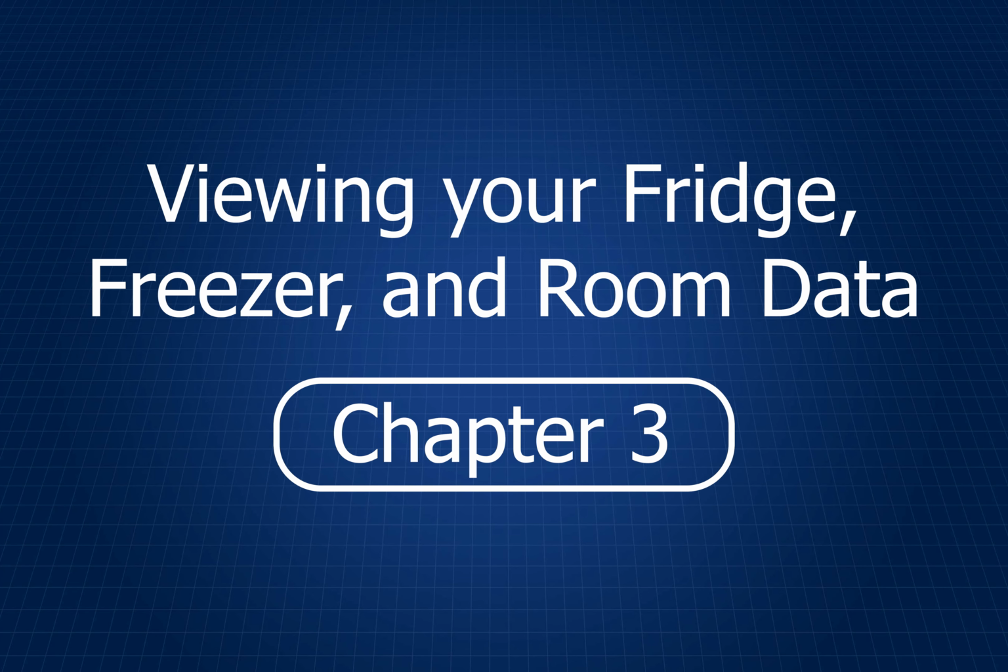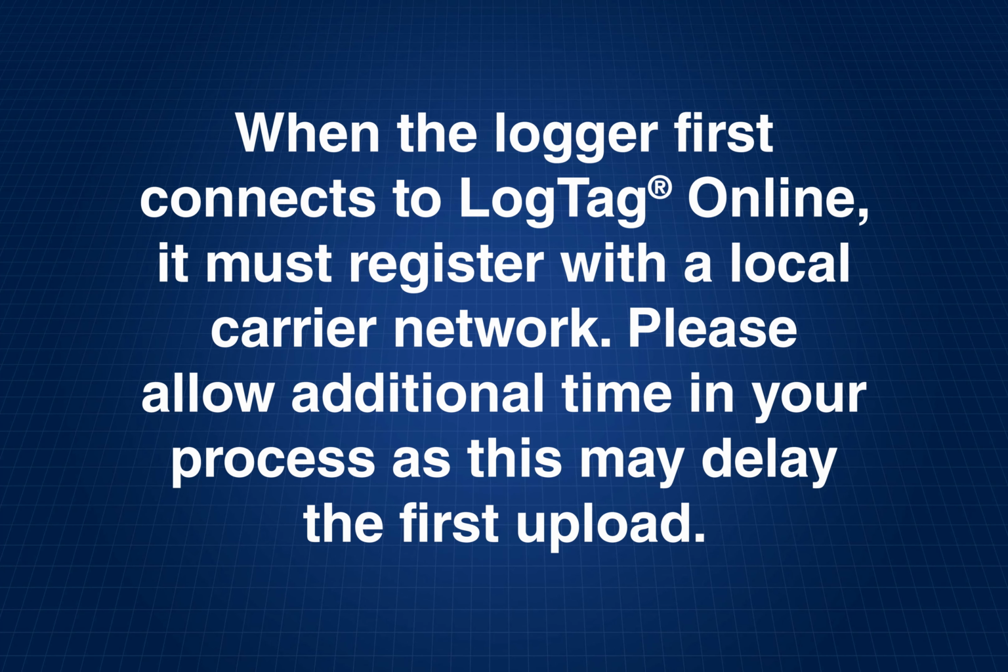Viewing fridge, freezer, and room data. When the logger first connects to LogTag Online, it must register with a local carrier network. Please allow additional time in your process, as this may delay the first upload.